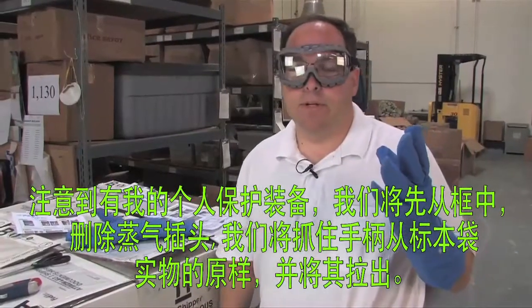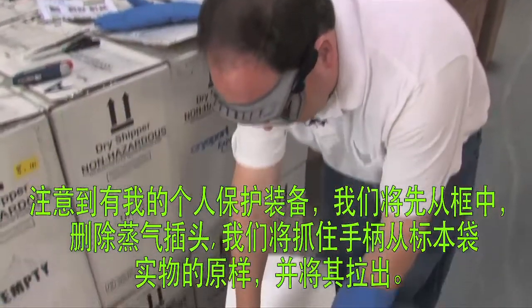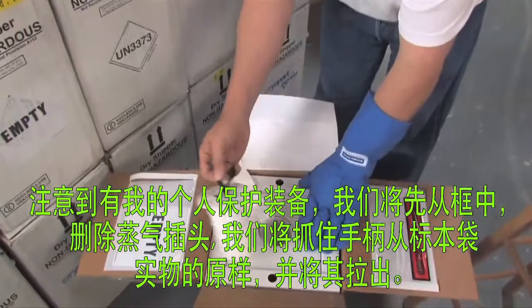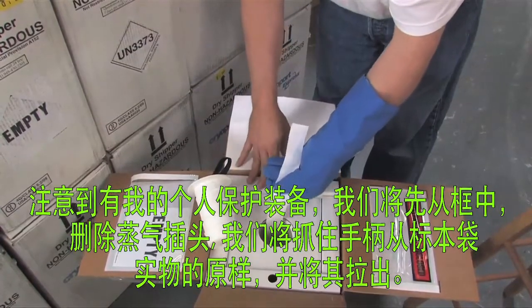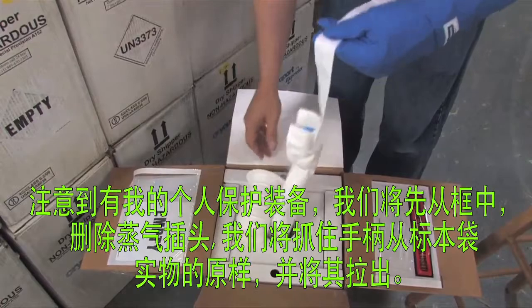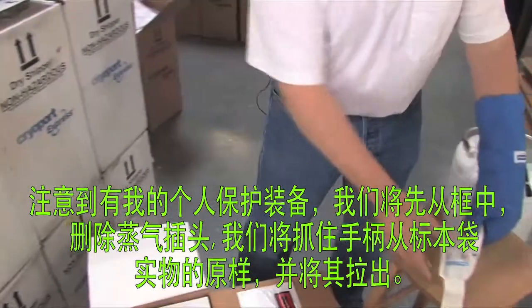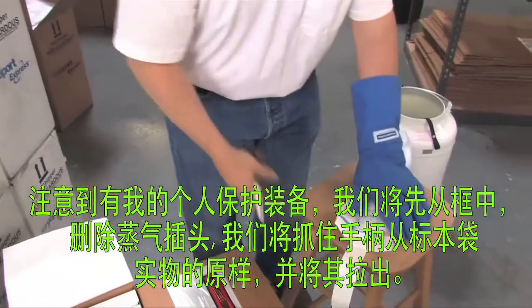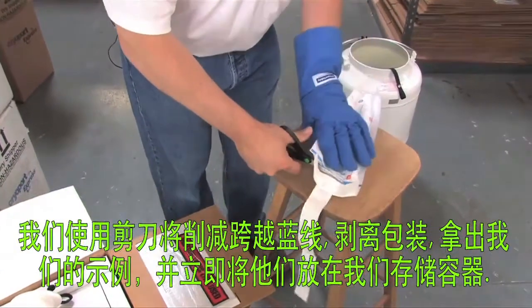Notice I have my personal protective equipment on, and we will start by removing the vapor plug from the box. Then we'll grab the handle from the specimen bag and pull it out. With our pair of scissors, we'll cut across the blue line.